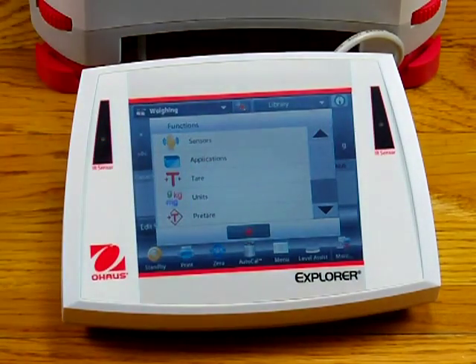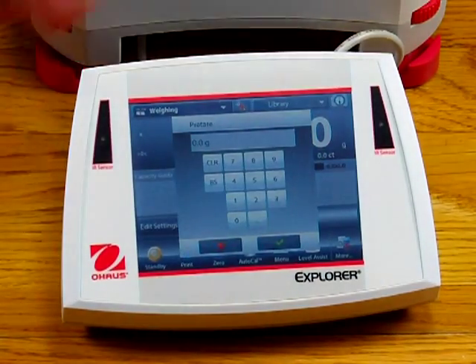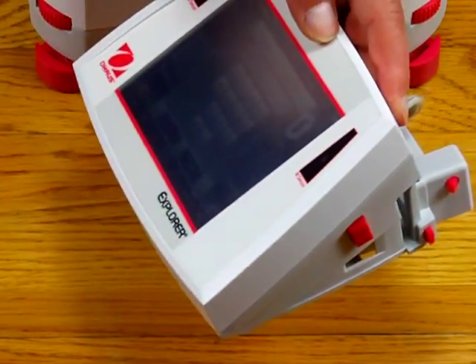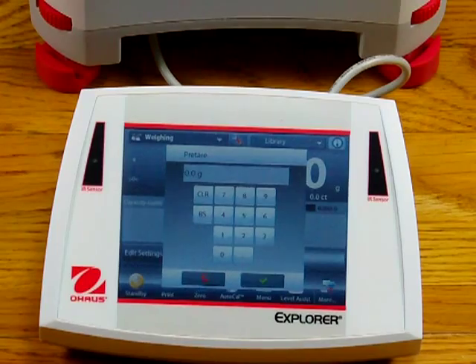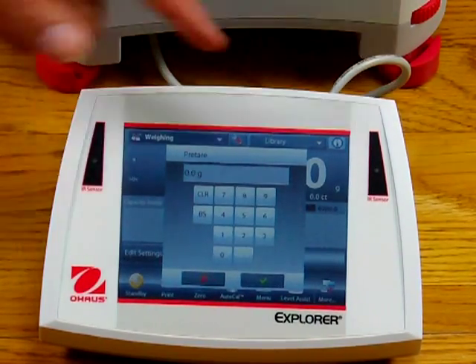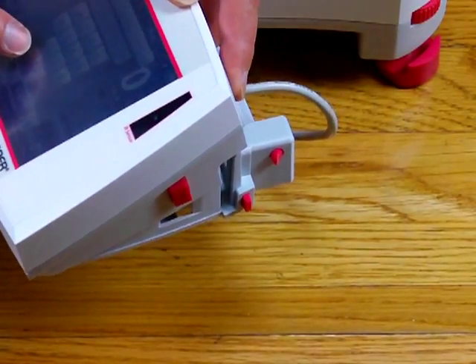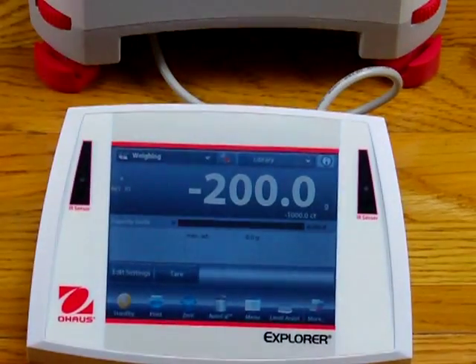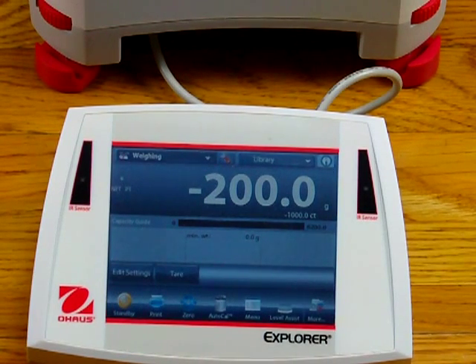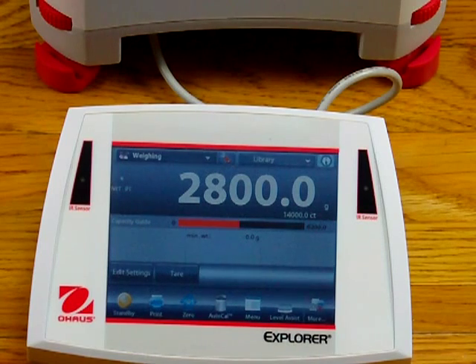This feature here is pre-tare. We can actually pre-tare a value — for example, if we had a weigh dish that we knew always weighed 200 grams. We simply enter in 200 grams and hit OK. Now it's automatically set to minus 200 grams. So if I put on a 3 kilogram weight, the balance will show 2,800 grams because of the pre-tare. A real nice feature with the Aarhus balance.